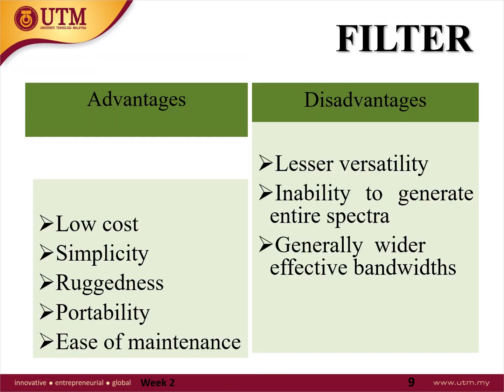Okay, the best thing about the filter is that it is low cost and also portable. That's why most portable instruments use filters, because they are rugged, stable, and easy to maintain. However, personally as a researcher, it is not going to give me a broad spectrum, because it is only one lambda at one time.